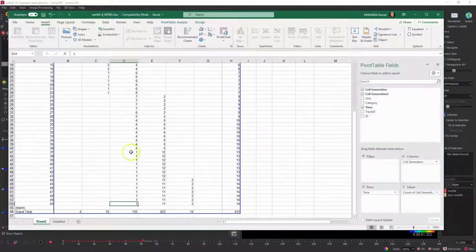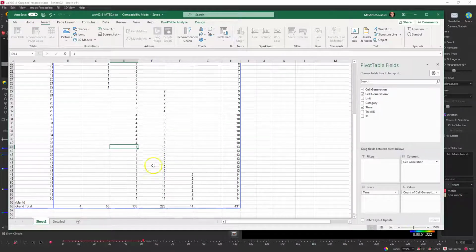So what this indicates here, the trailing 1, is that maybe at some point we needed to split this one into something else, but maybe it didn't split off. It's just how the tracking algorithm works, whether something splits or something continues to be on its own. So this might have just been splitting in 3D and we just didn't notice because we had a 2D image.